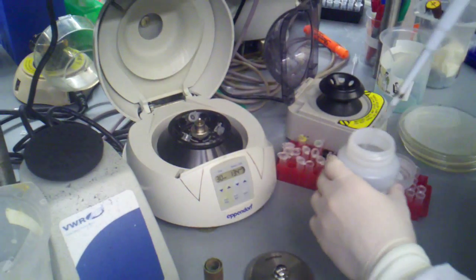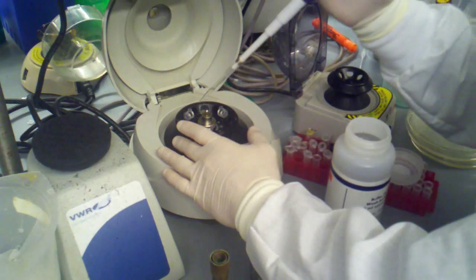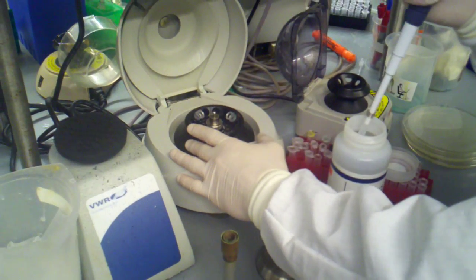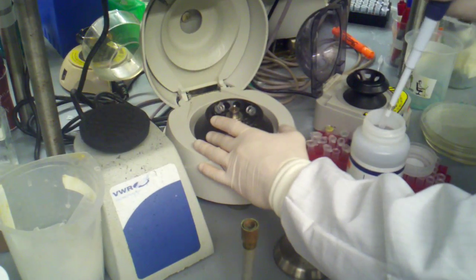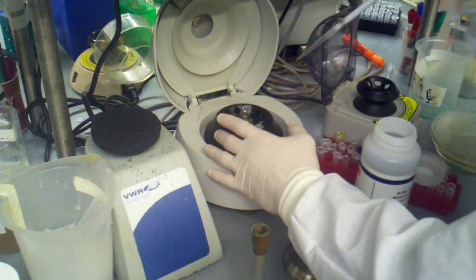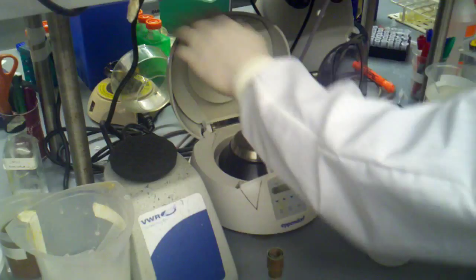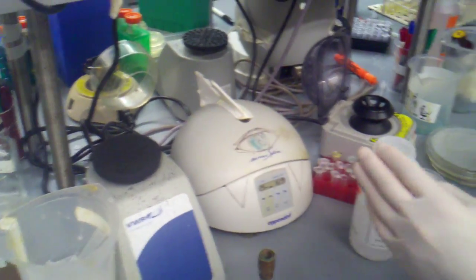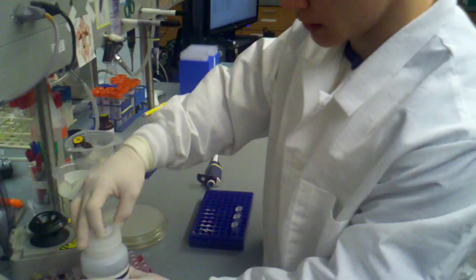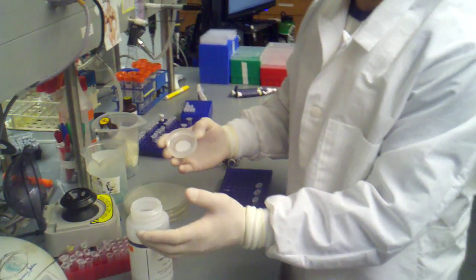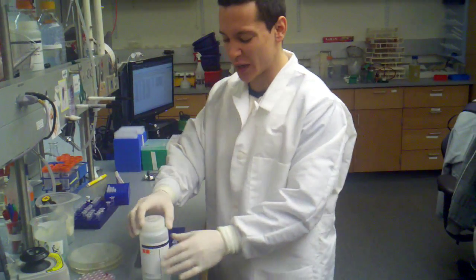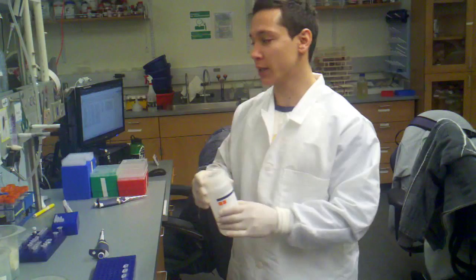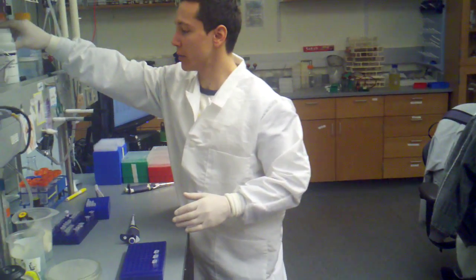We're going to do our second rinse. Again, we don't need to check the flow-through columns because the total volume that we're adding here should be less than the total capacity of that flow-through. So that's three. I'm going to cap that up, spin it, ditch the tip, recap my PE. You don't want to leave this open for too long because this wash buffer is mostly ethanol, and it will evaporate. If it evaporates, you shouldn't be too worried about it, but it can throw off some of the buffering conditions.